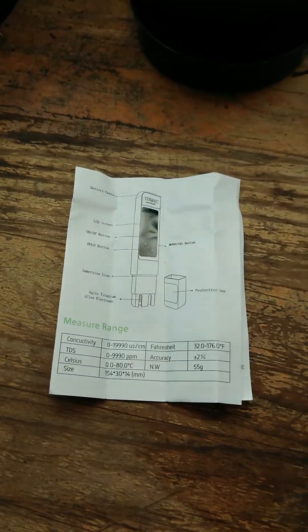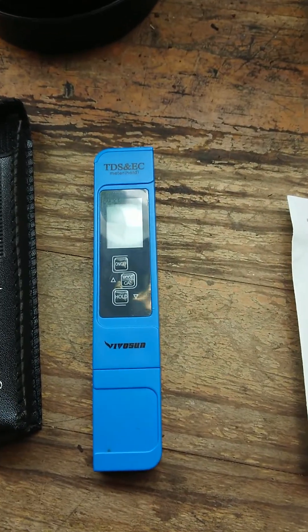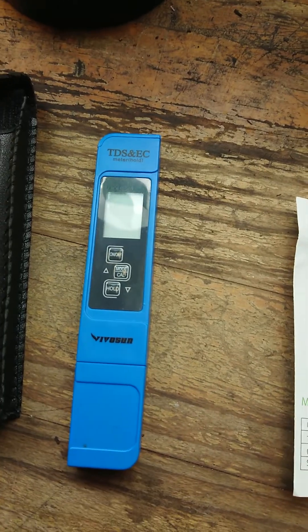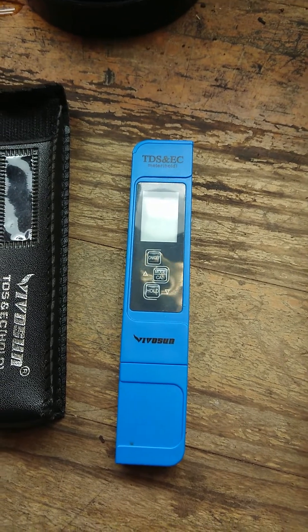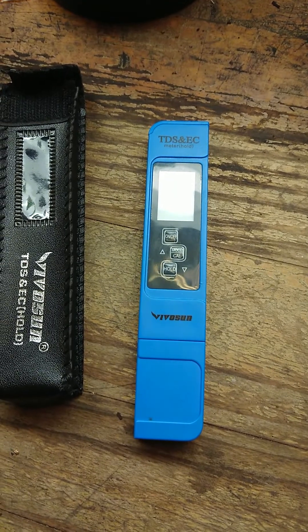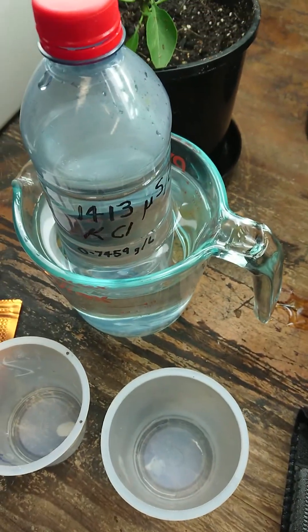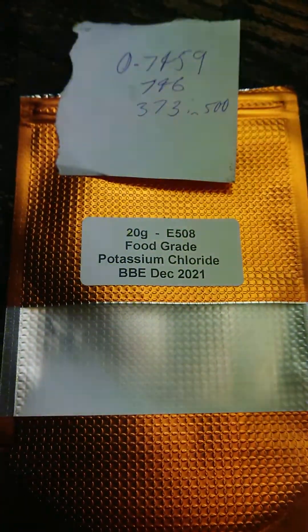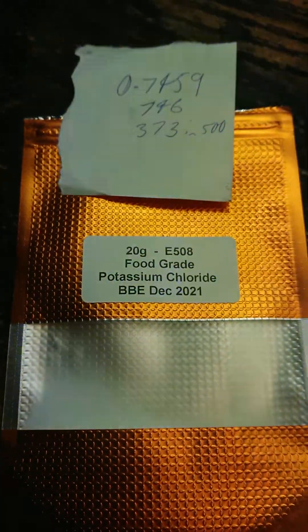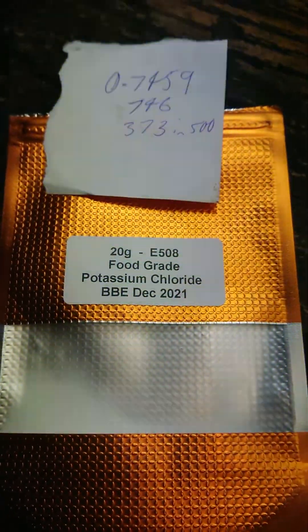I've come across the solution — it's really quite simple. The TDS and EC meter is actually just an EC meter with a conversion factor of 0.5 to obtain the total dissolved solids, or total dissolved salts, in parts per million. It's recommended to calibrate this unit to a calibration solution of 1413 microsiemens per centimeter. I have some of that solution here, made by combining 0.7459 grams of food grade potassium chloride in one liter of demineralized or distilled water.